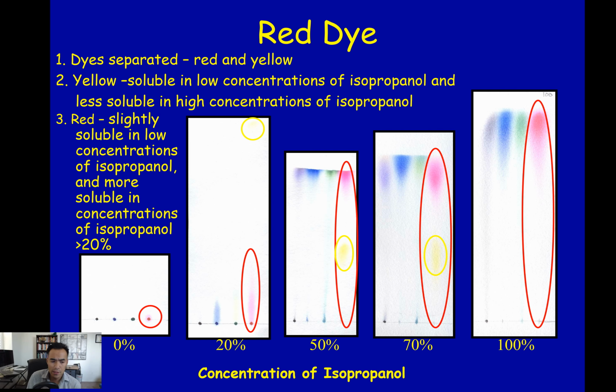Okay. All right, guys. Well, hopefully this helps out a little bit with the experiment. Make sure you review your data and analyze specifically what that factor is. Now, normally in these types of experiments we study what we call the Rf factor, or the retention factor. How far has the dye traveled relative to the solvent? So if the liquid is about halfway in, it's about a 50% or 0.50 retention factor. If it's all the way with the solvent, it is 100% or a 1 retention factor, which means that it is completely dissolved in that solvent, and that allows it to have that degree of separation from the other ones.